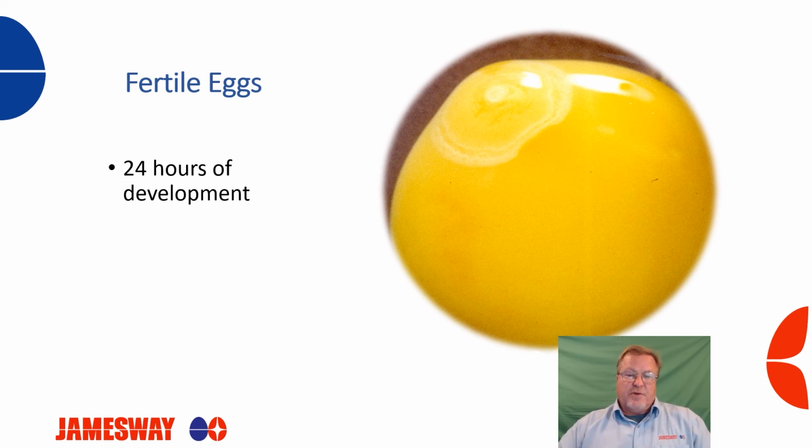Now, as we go on to a residue breakout, it's a little bit more difficult to see this, but we're still looking for the same pattern of cellular development in that donut-shaped fashion. So once we do this, we can definitively determine fertile and infertile egg, and that is very important in our system to be able to make that distinction.